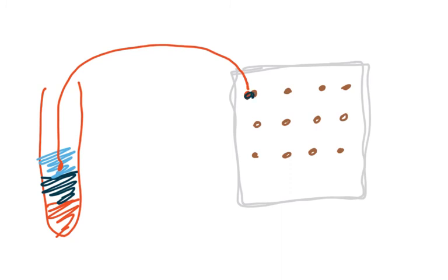It means that starch is still present, and we keep on doing this after every 30 seconds. So after some time we will find out that it remains black. Every 30 seconds, black, black, black, black, black, and finally it is brown.